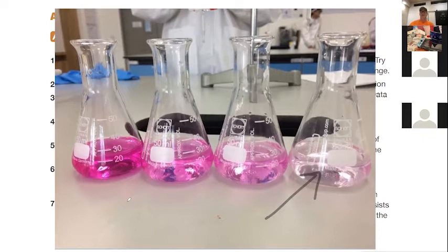The other thing is that this volume is much greater than what we're going to be using. We're going to be using a really small volume, like around 10 mils. This is about 25 mils. And so our color is going to be more intense than this.